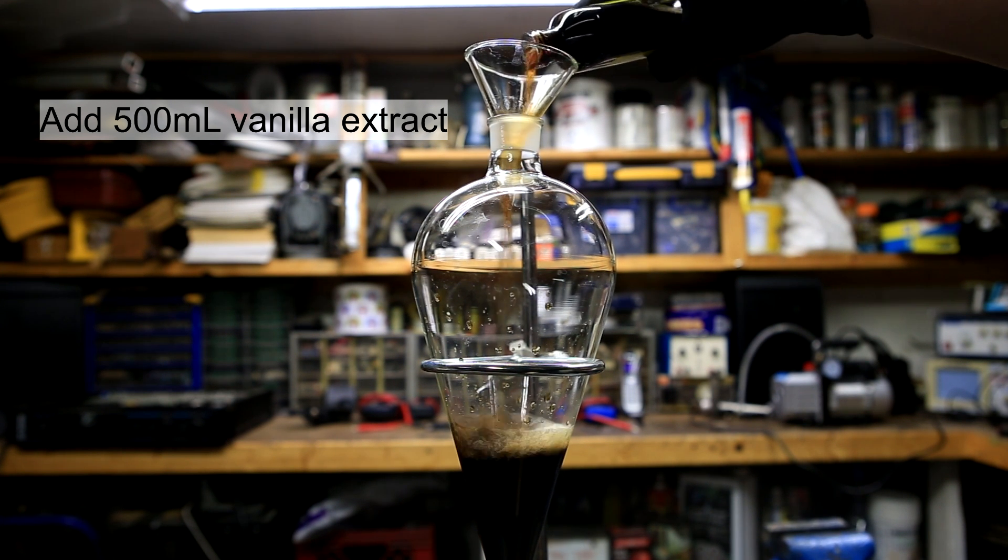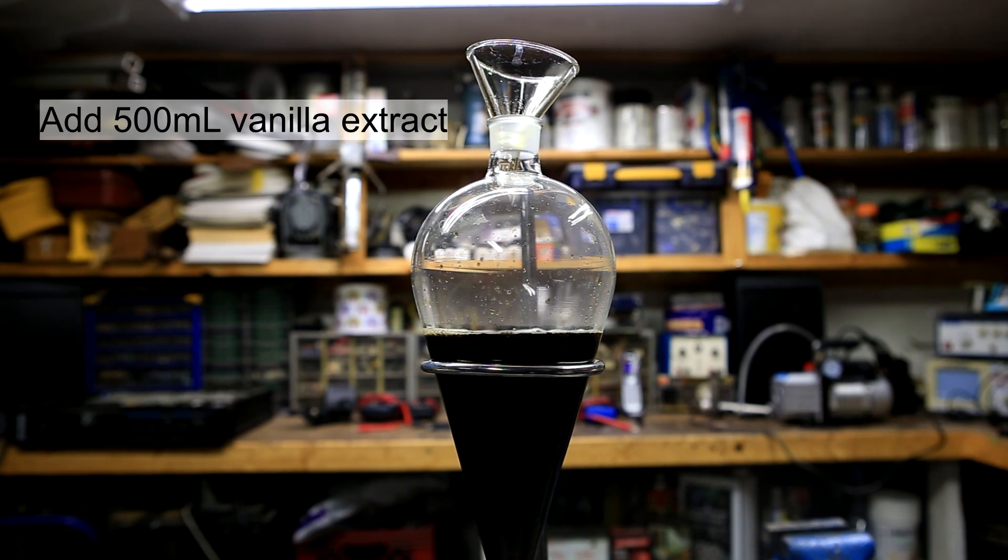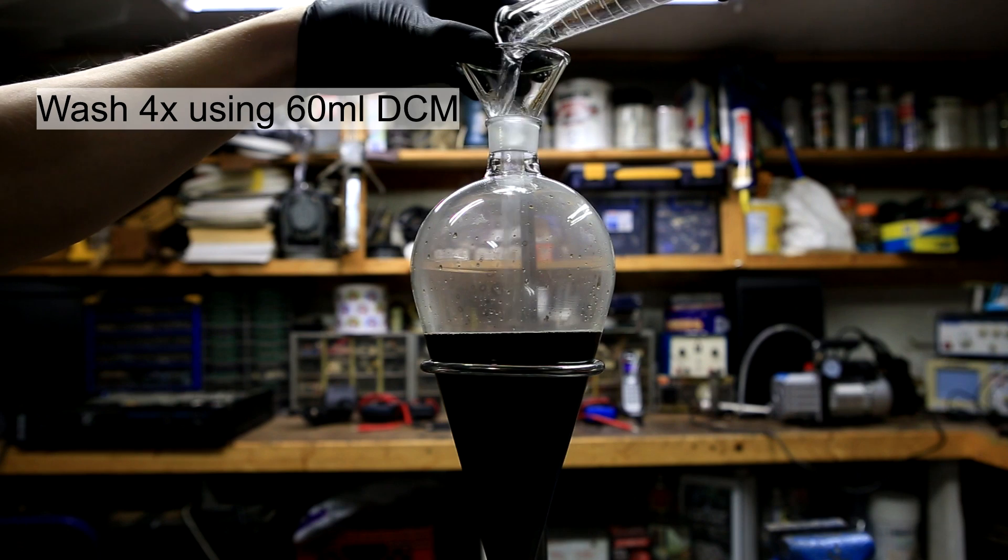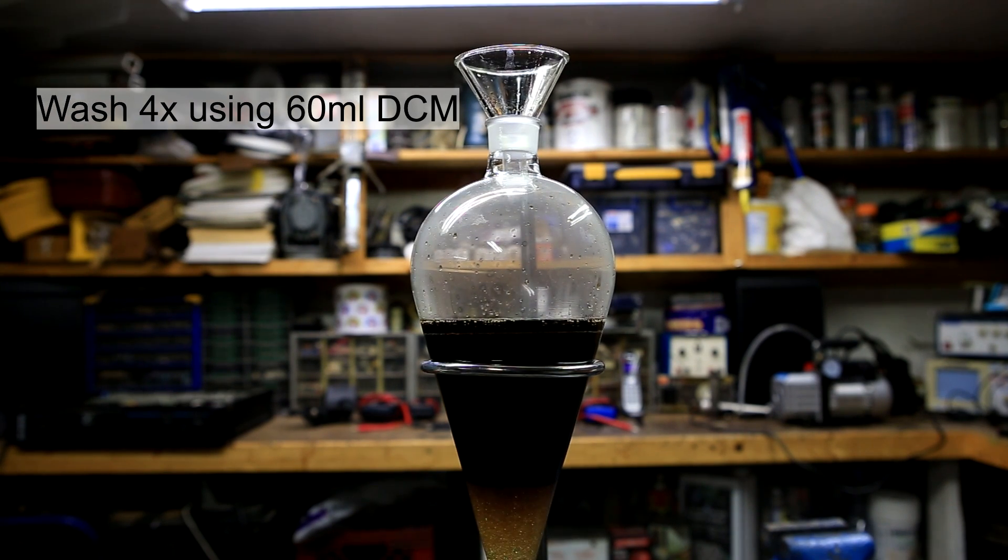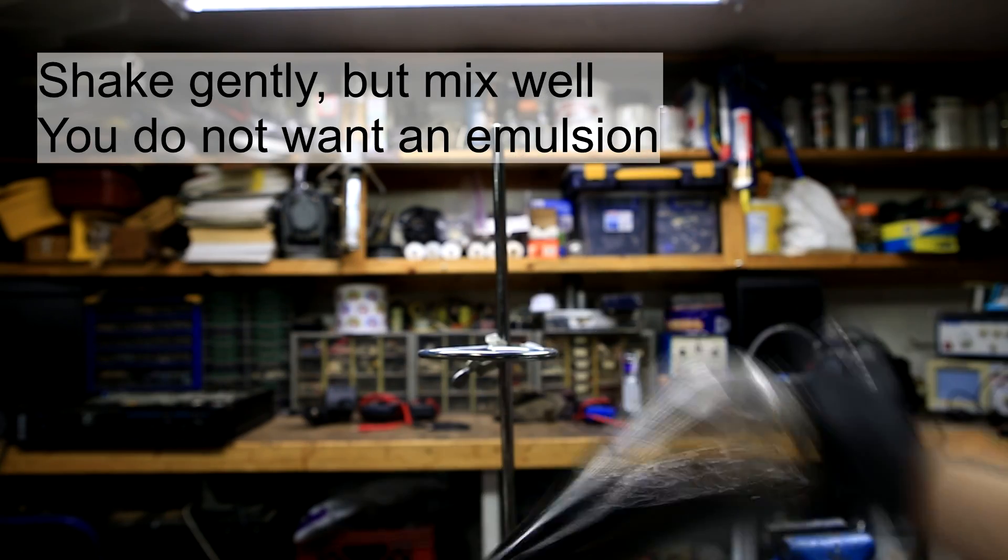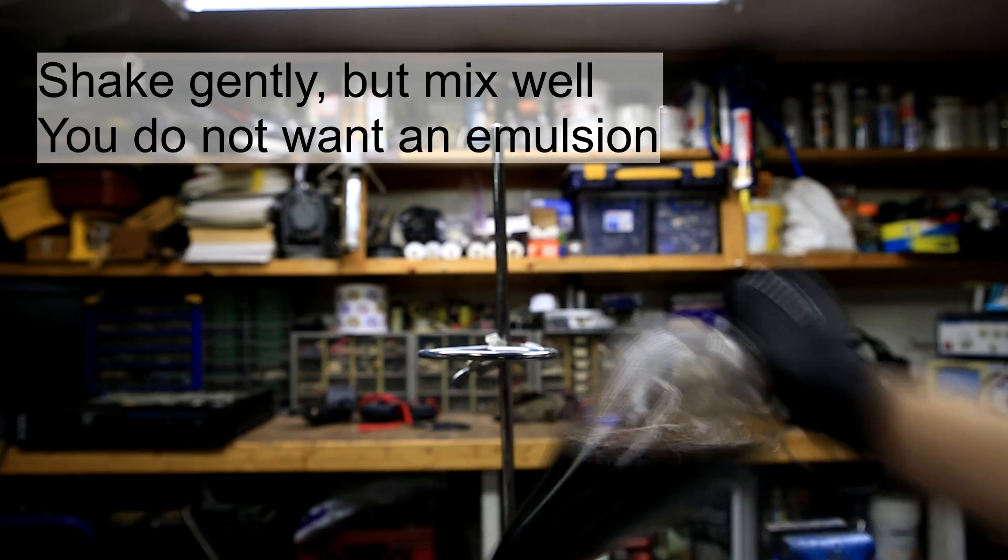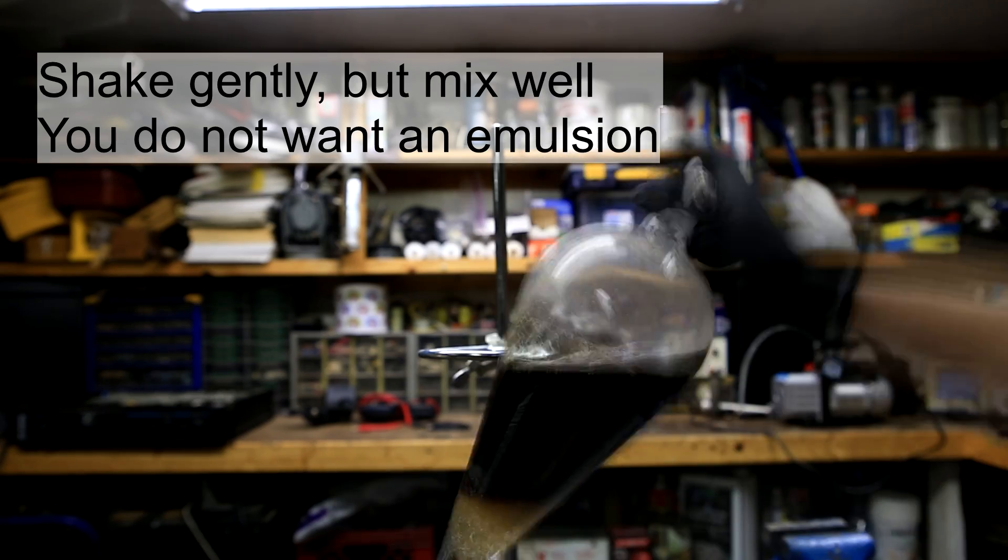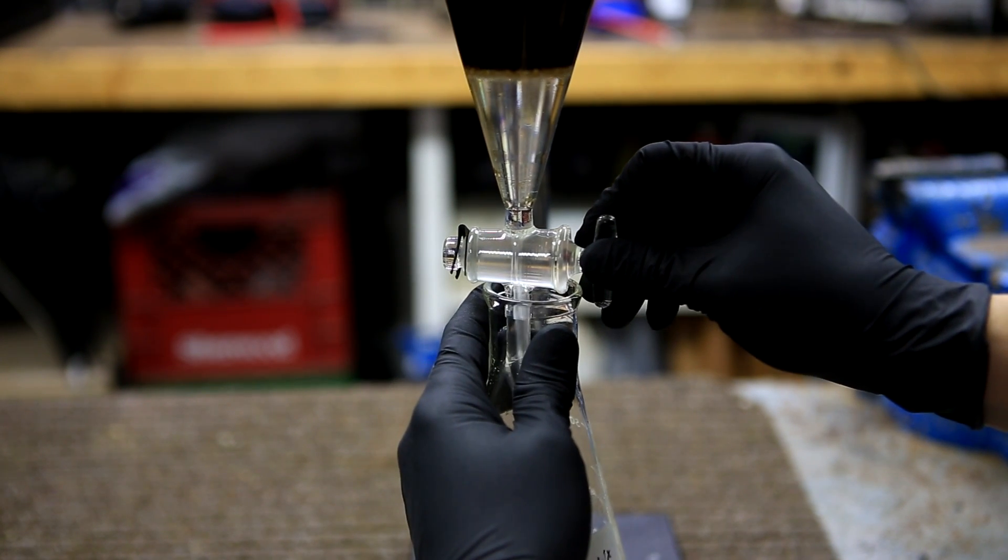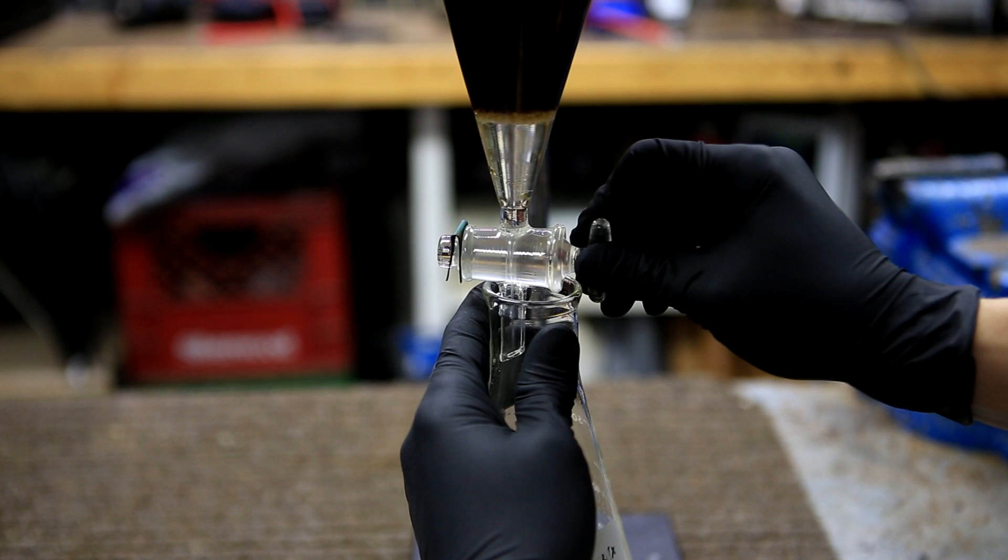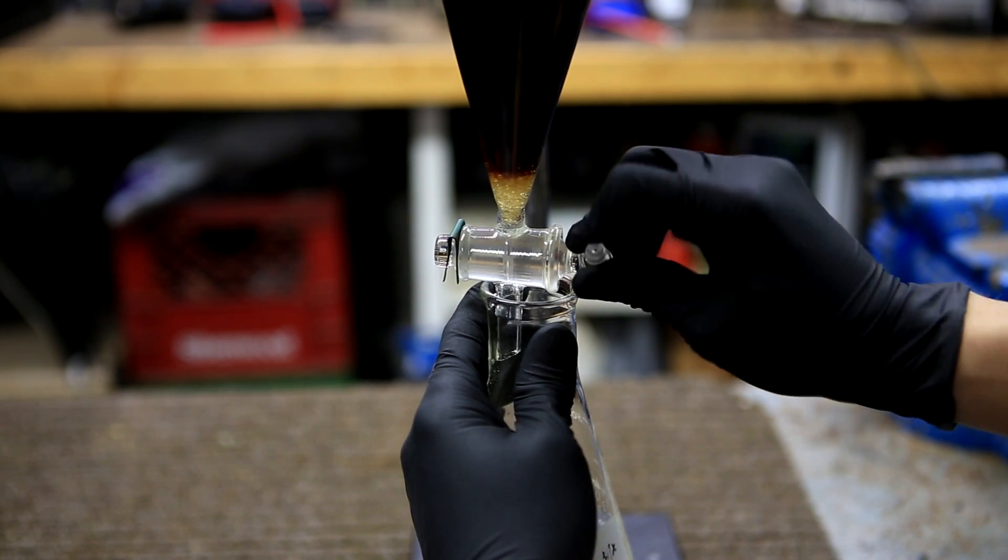To a separatory funnel is added 500 milliliters of artificial vanilla extract. The vanillin is extracted using four washes of 60 milliliters of methylene chloride. After each addition, the separatory funnel is capped and shaken gently in order to prevent the formation of an emulsion. The layers are allowed to separate and the lower dichloromethane layer is drained into an Erlenmeyer flask. As stated before, this process was conducted a total of four times.